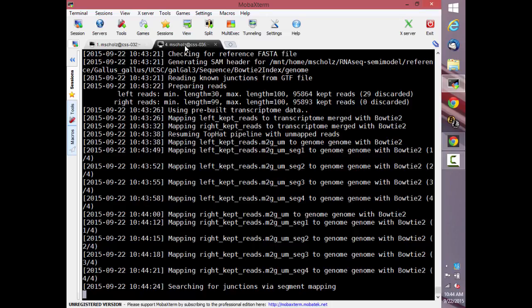I'm going to try to take you through the tutorial. This is where it's going to get a little hit and miss until lunchtime, and then we'll eat some lunch. You guys can go away if you want, or you can stick around and ask questions and play and see what else we can do after lunch.